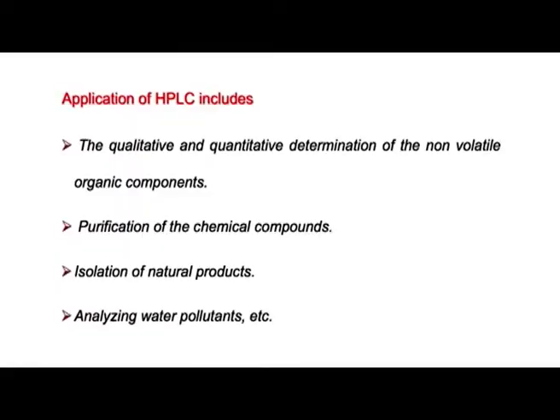Up to now, this is the only known method that can very efficiently and quickly separate the individual components according to their chemical nature, irrespective of molar mass. So, the applications of HPLC mainly include the qualitative and quantitative determination of non-volatile organic components, the purification of chemical components, isolation of natural products, and analyzing water pollutants and any components that are present in a complex mixture of samples.